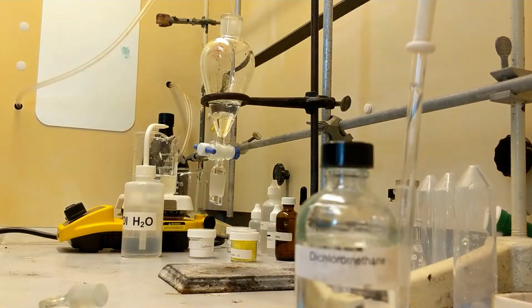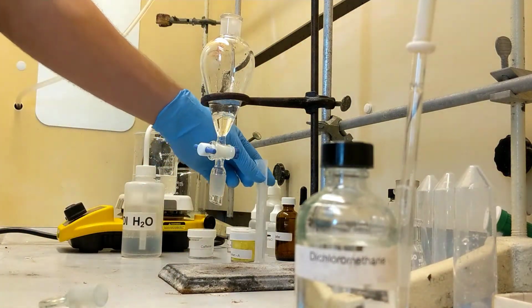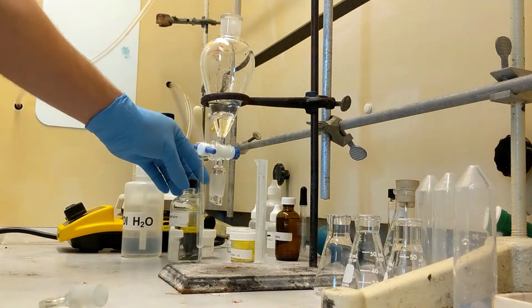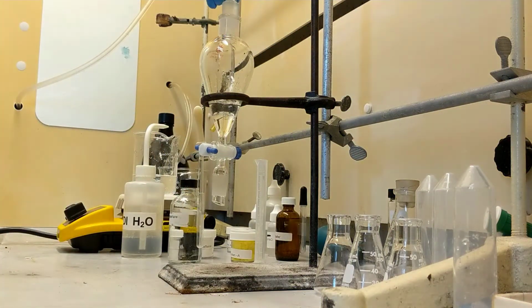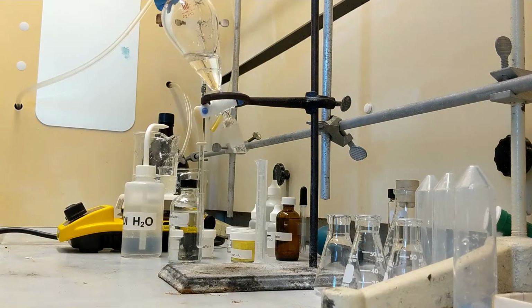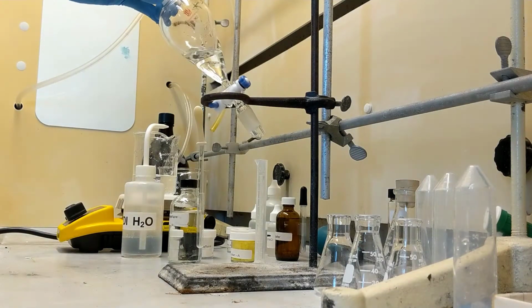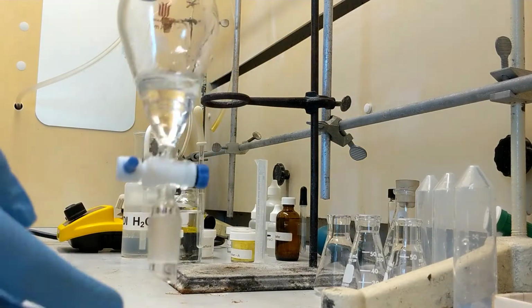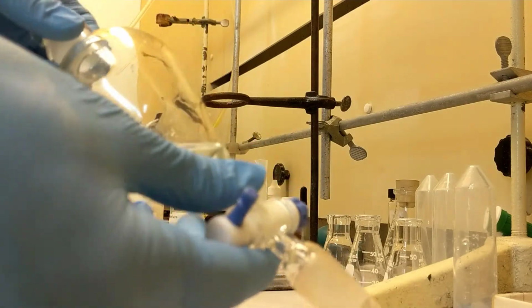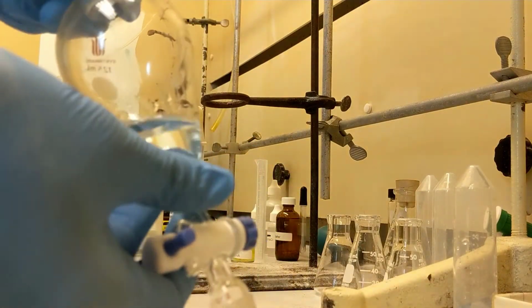So I just added an organic solvent to an aqueous solvent, and this is where the extraction happens, okay? So I'm gonna cork it. I'm gonna pull out my separatory funnel so you guys can watch, okay? So what I'm about to do is make sure my stopper is nice and firm.